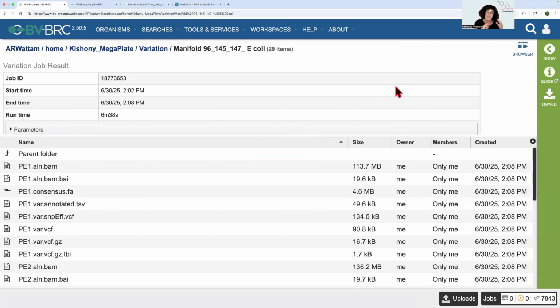Okay. So this is the results landing page, and you will notice that there are a lot of files and a lot of things going on here. The service is amazing in the kind of things it gives you.